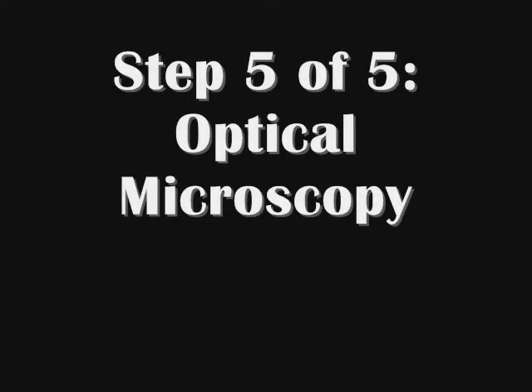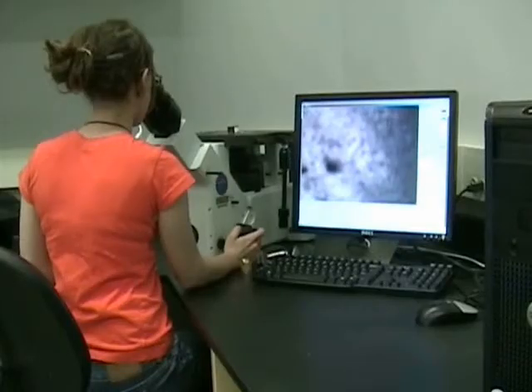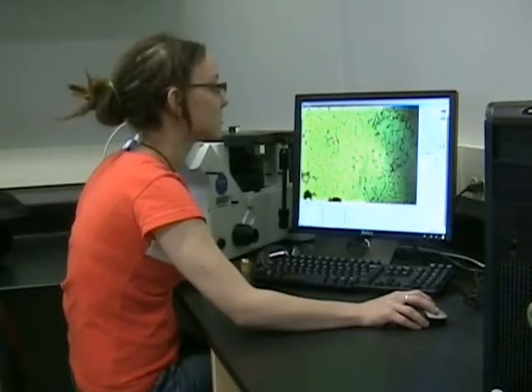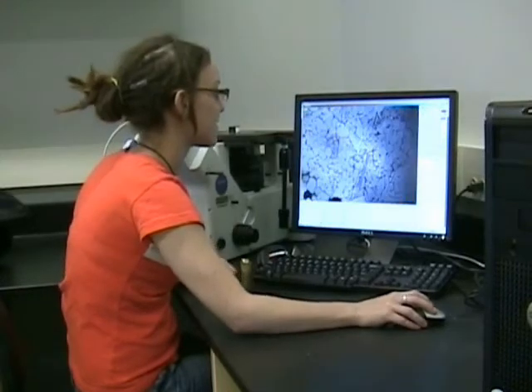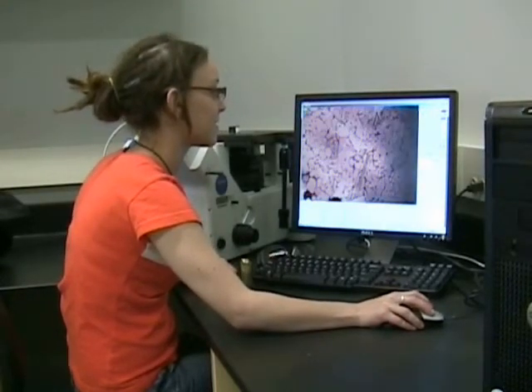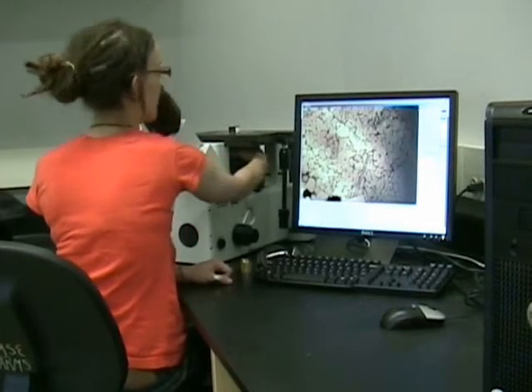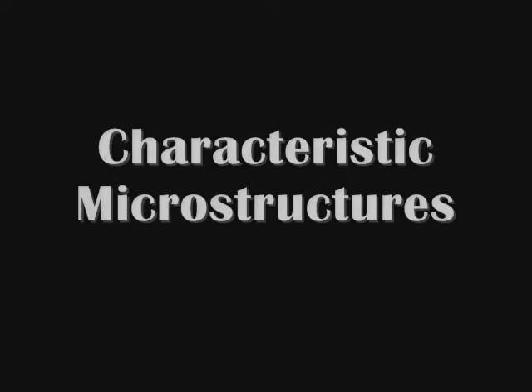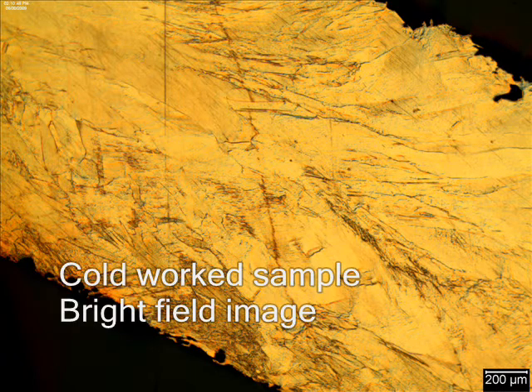Microscopes are used to observe the microstructure of the polished and etched sample. Most microscopes have a real-time camera attached so you can see what you're doing, and on the computer you can alter the image settings to make the image look as good as possible. If you need to see something in more detail you can increase the magnification. In a typical cold work structure such as this cold-hammered copper, the grains are elongated in one direction. This is a bright field image — in bright field imaging the grains appear bright while the grain boundaries look dark.